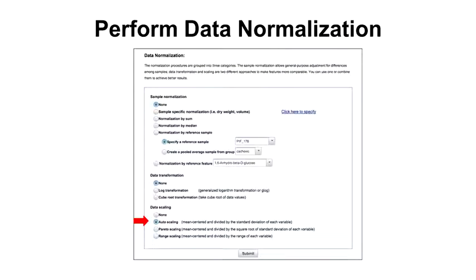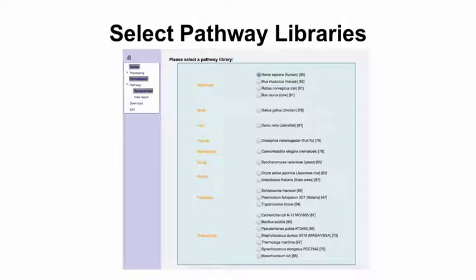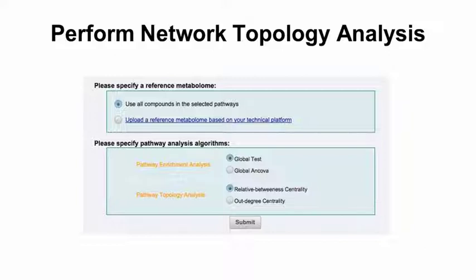These are the parameters that are preferred overall — they produce a nicely normalized distribution. Because we know we're working with humans — Homo sapiens — we can choose our pathway library. Obviously, if you chose the wrong pathway library, you'd end up with something that's meaningless. From this stage, once you've chosen the correct pathway, we can start looking at the network topology analysis — using all compounds in the pathways, doing both a global test assessment and a relative betweenness centrality assessment.